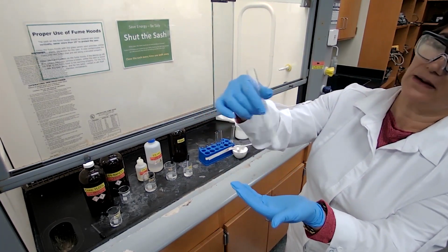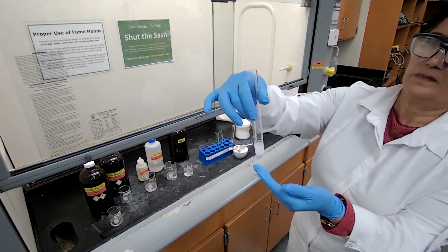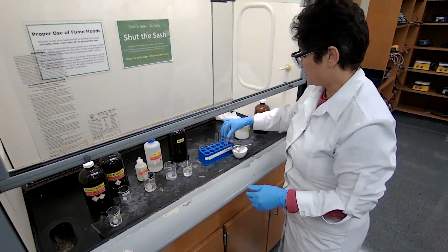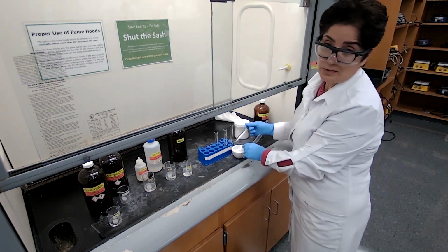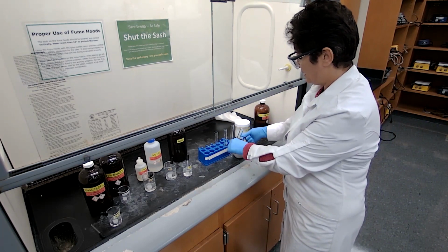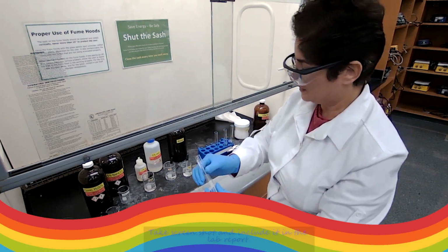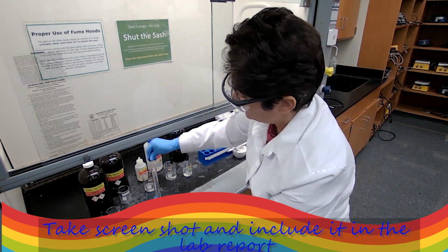It is not clearing, so unknown B is not soluble in HCl either. Since it's not soluble in water and HCl, we use 10% sodium hydroxide and test the solubility. Again, be consistent, with the same amount of solid and 3 full droppers of the solvent.